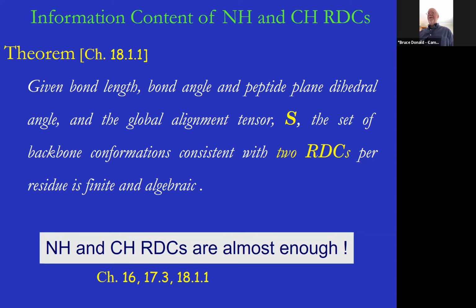So this tells us that this is almost enough data to solve a protein structure ab initio from exact equations. And that's, I think, really interesting to our class because we're interested in algorithms whose complexity, completeness, and so forth we can understand, just using geometry. So that's why I think it was worth going into this geometric analysis here.